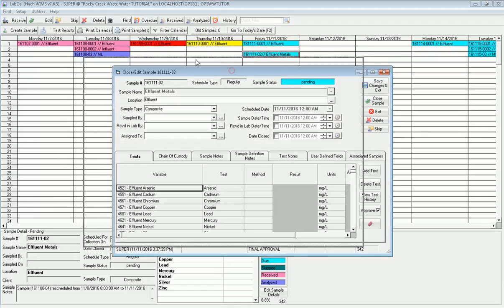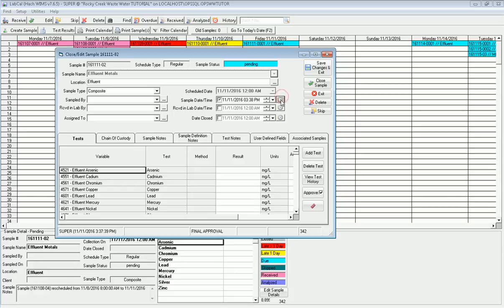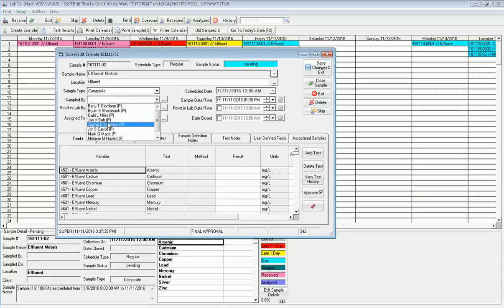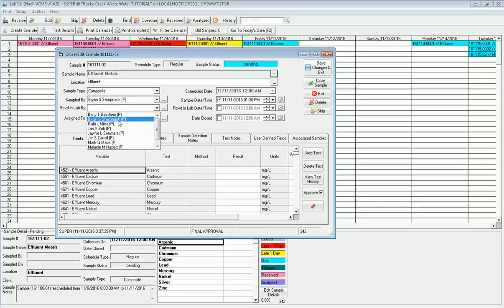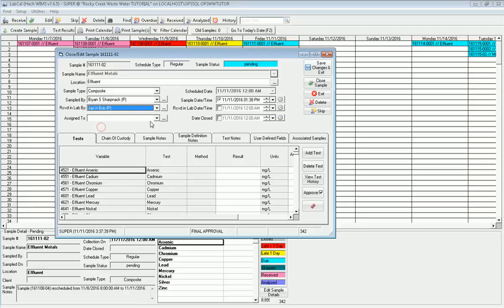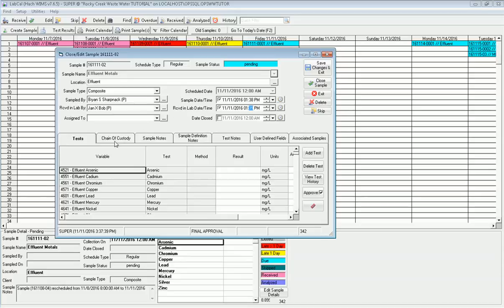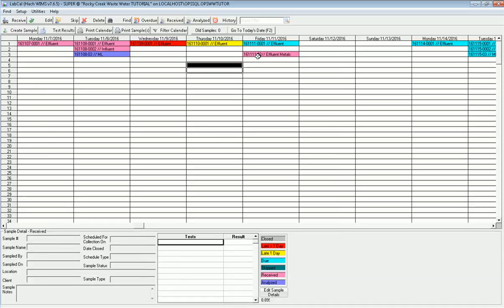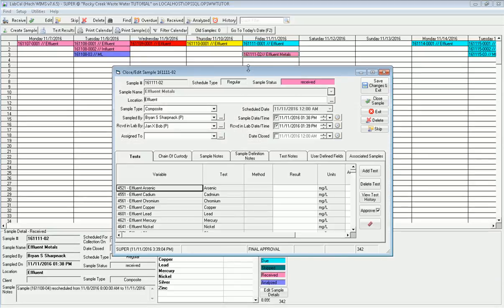Now if I want to work on this sample, I simply just double-click on it, and it's going to bring up the information and allow me to start to take this through what we would call the work cycle. I'm going to say I took the sample. Let's say I click this, and it defaults to right now. But I actually took it at, let's say, 1:38 in the afternoon, and it was sampled by Brian Sharpnack. I can also say when it was received in the lab and who received it. I could say Jan received it, and he received it at 1:39. Brian's very fast. These are optional fields. The sampled by and sampled date time need to be filled in. Now I go ahead and click Save Changes. Notice that that sample automatically changes colors, and it's marked now as received.